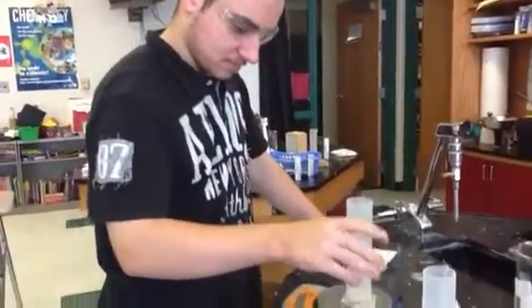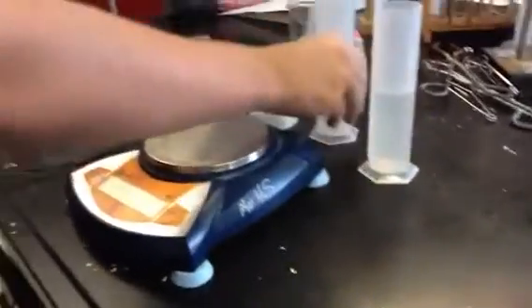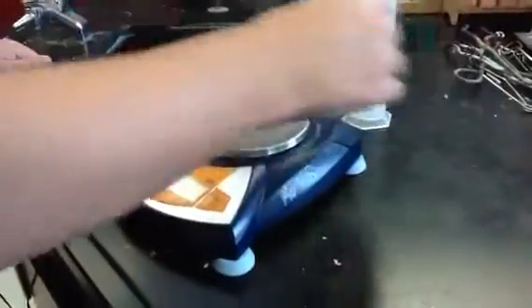We're going to zero this first. Now it's zero. Take that off. Then we put this one on.